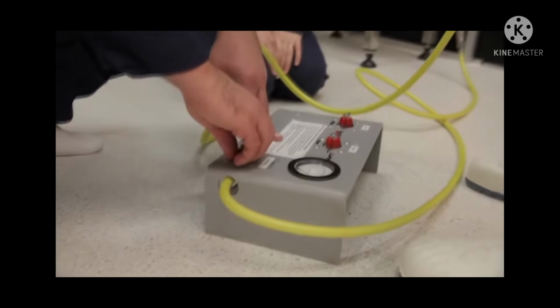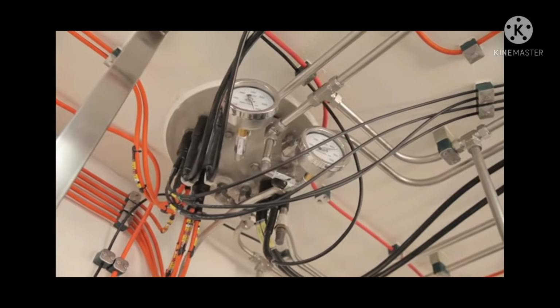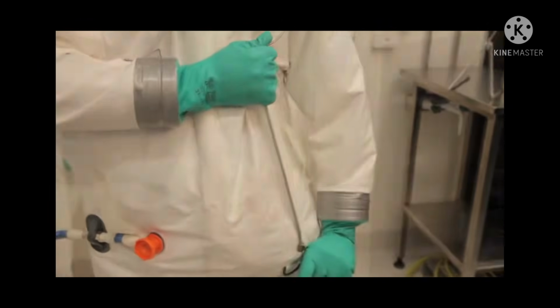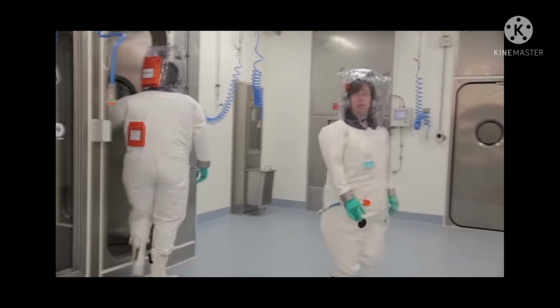Before entering the laboratory, scientists pressurize the fully encapsulating positive pressure suit, the latest model available to scientists, and check both air supplies to ensure their equipment and lifelines are operating efficiently. Once inside, they can then move around freely.